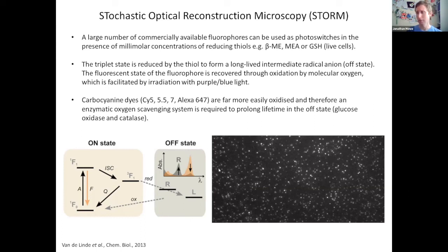Now, from this off state, the molecules obviously need to get back to the fluorescent state in some way, and this is an oxidation process. And this can actually be facilitated quite often using UV light. So it's a kind of photo-oxidation.